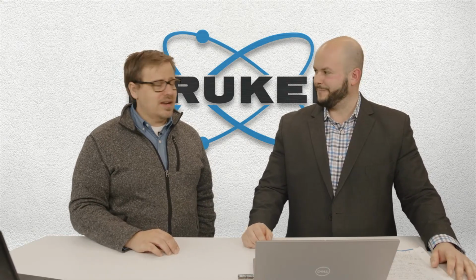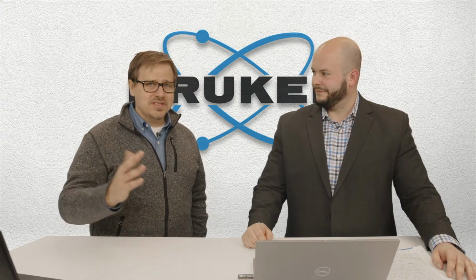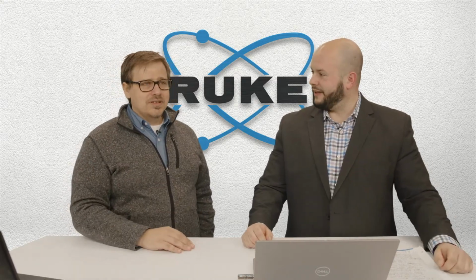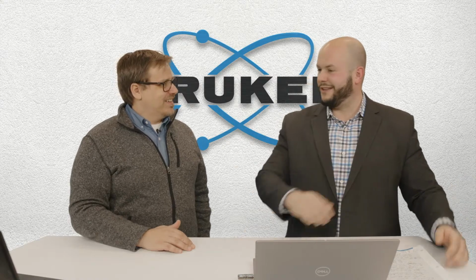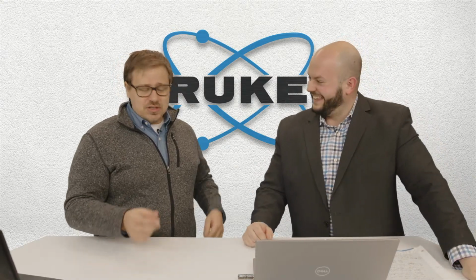That being said, I've also done this on a microfocus source sitting at 50 watts or something. Like the old light bulbs. That's right. One of the benefits there is that since you're hitting a smaller area on the sample, sometimes you get cleaner results because you have less variation in the thickness.